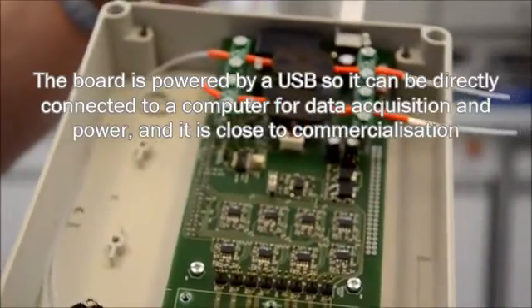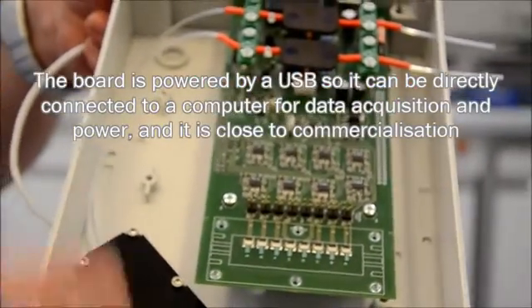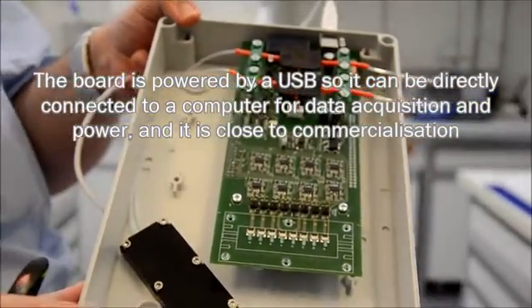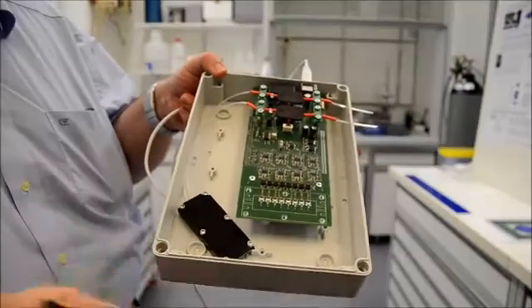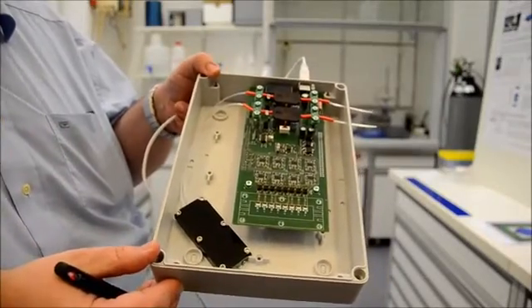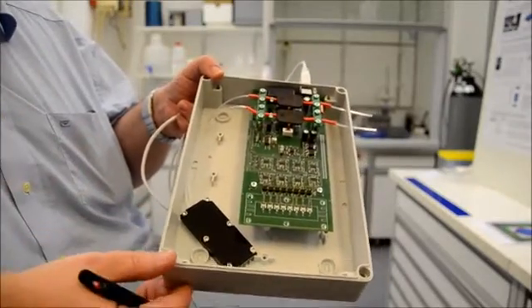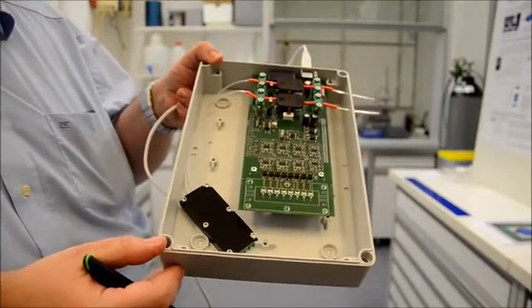This board is powered by the universal serial bus. So, it can be directly connected to the computer for data acquisition and also for powering. And we are close to commercialization of this technique, together with the company that fabricates these sensors.